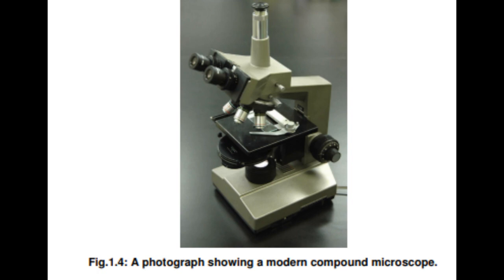The lenses are aligned in such a way that they can bend light for getting effective magnification of the image. The resolution of a compound microscope is about 0.2 µm. The limitations of resolution and magnifying power found in a simple microscope can be overcome using this microscope. The magnification of the objective lens and eyepiece manage the magnifying power of the compound microscope.